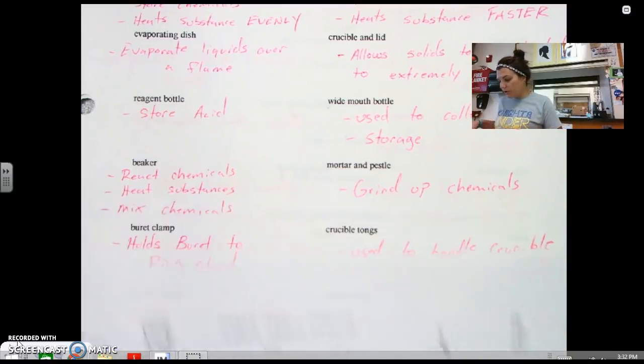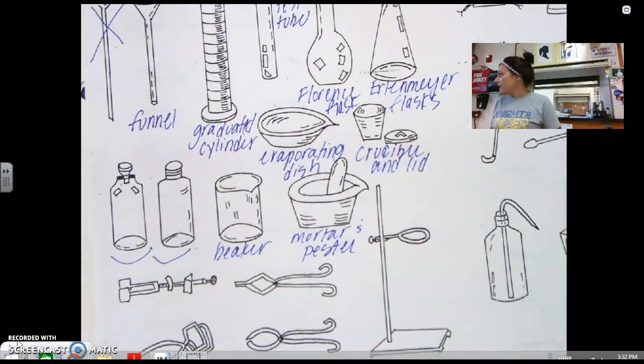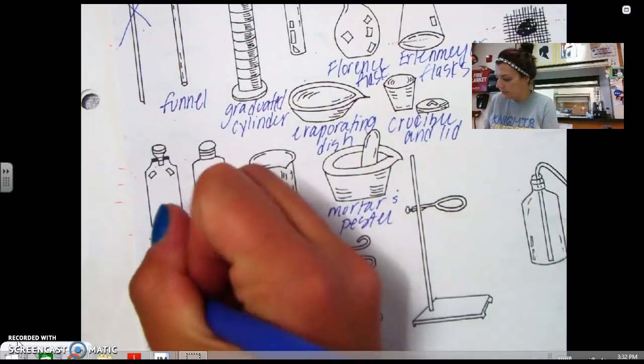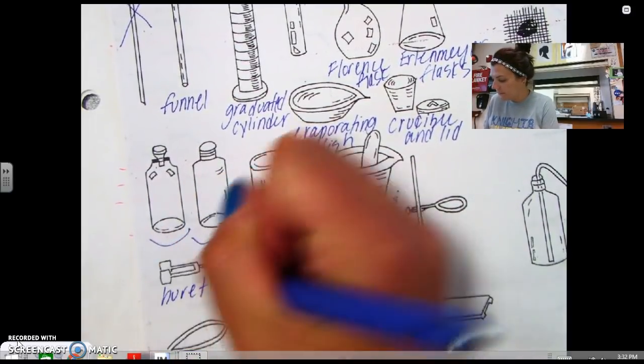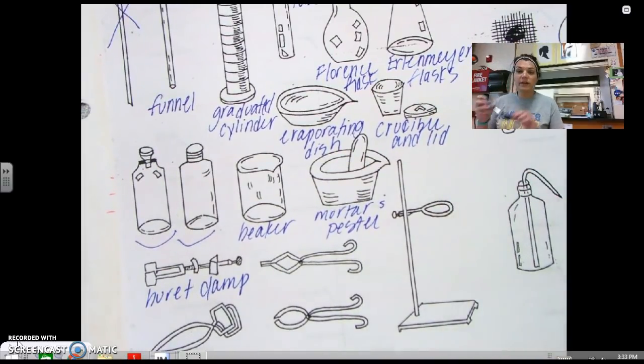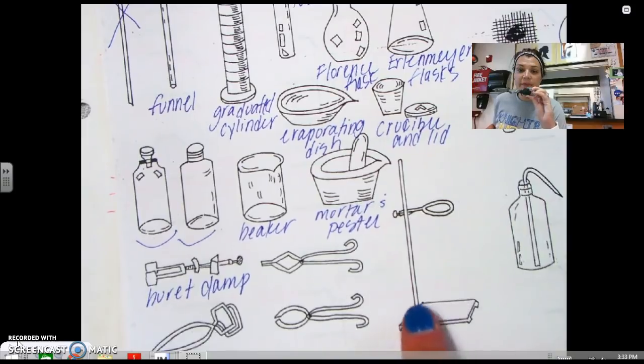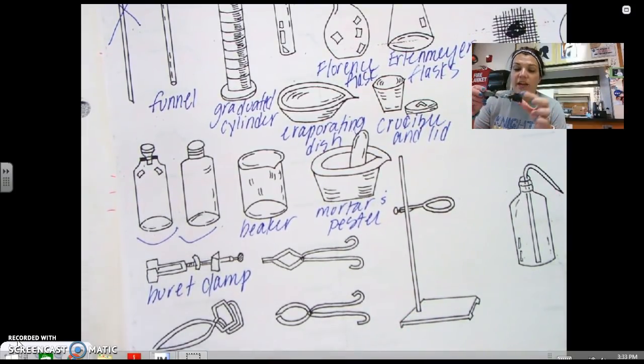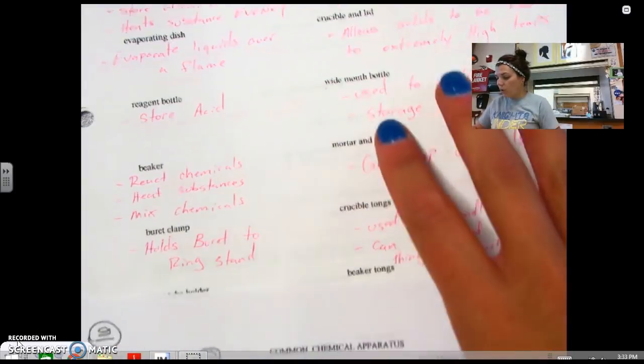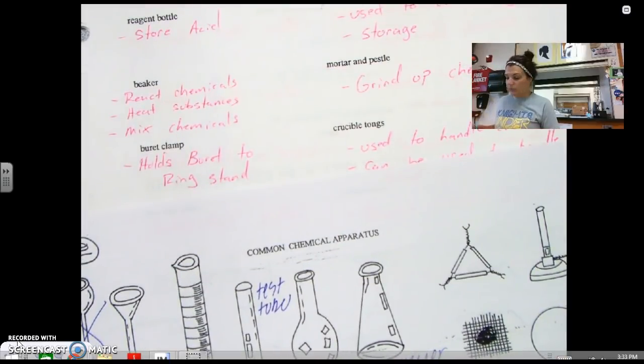The next thing is a burette clamp. Now this one is a little bit different. Burette clamp. And obviously if it's a burette clamp, it's going to hold a burette. And we're going to get to this guy here in a second. But this is what it would go on to. And ultimately a burette would be able to fit inside of this. So obviously a burette clamp holds a burette to a ring stand, which we'll get to a ring stand here in a second.